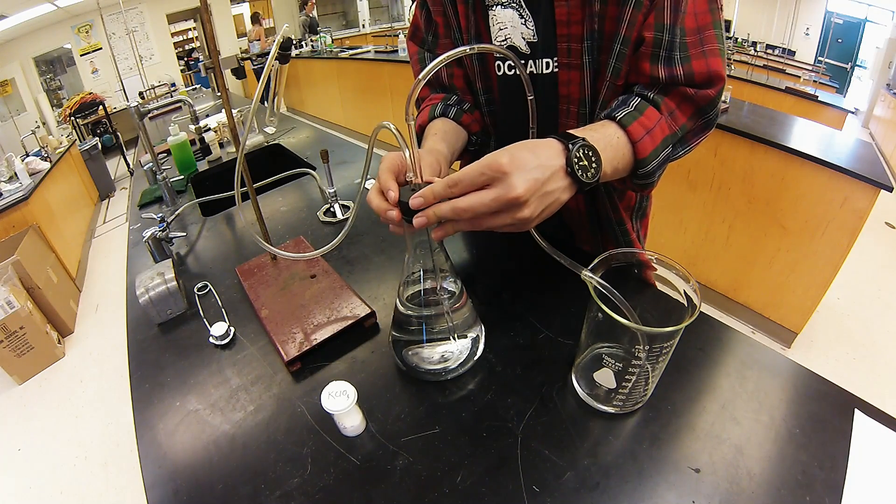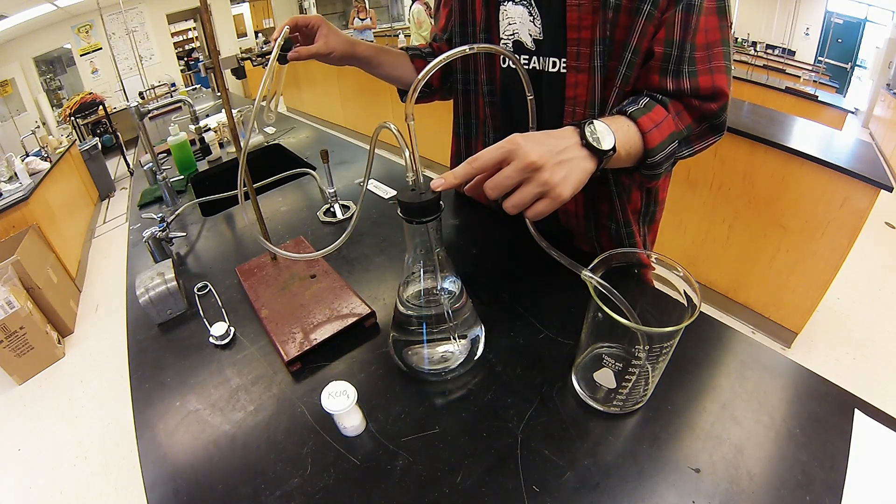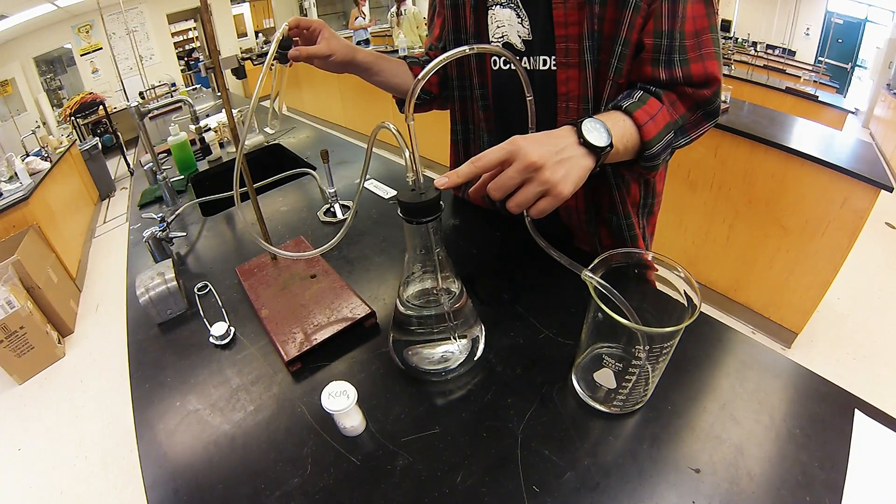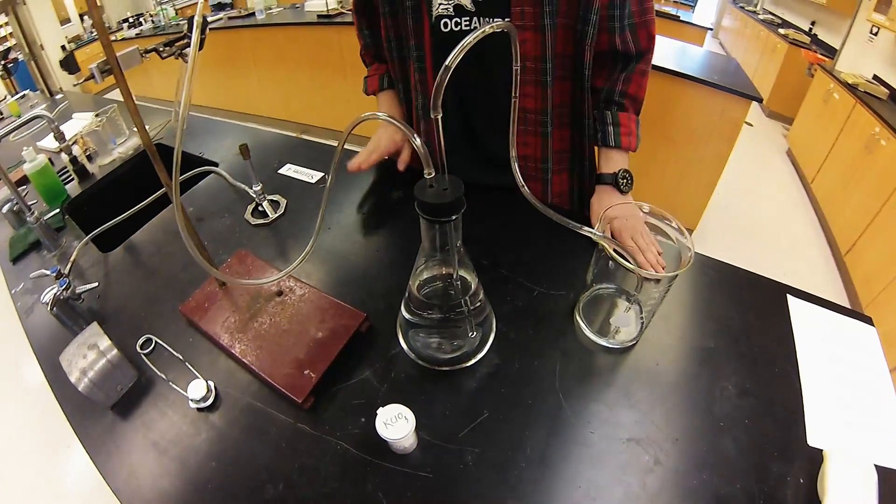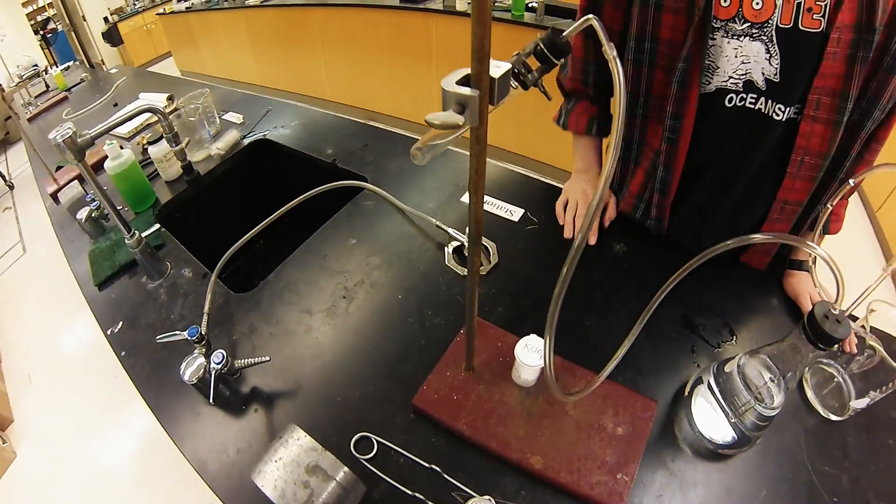We'll need two stoppers - one with two inserts and another with one insert for the test tube - and some tubing to connect it all, and of course the potassium chlorate.